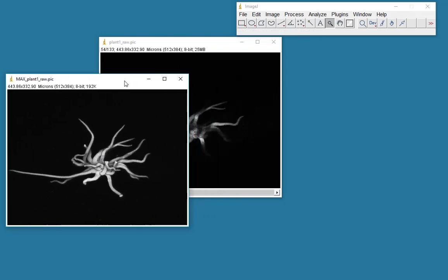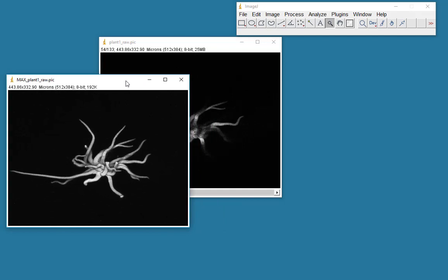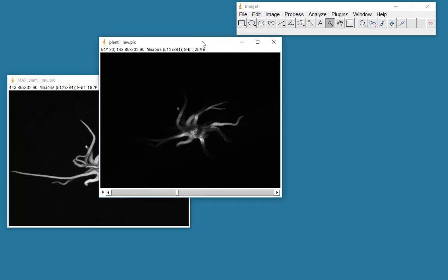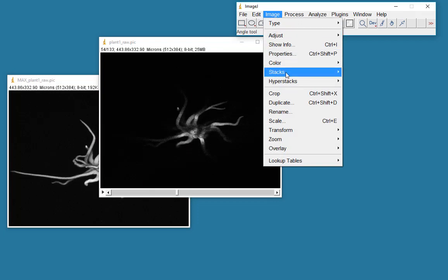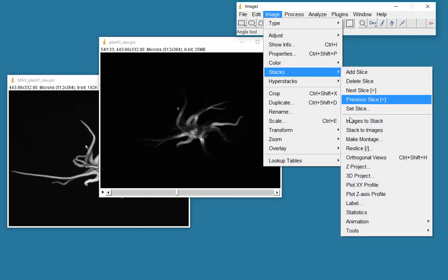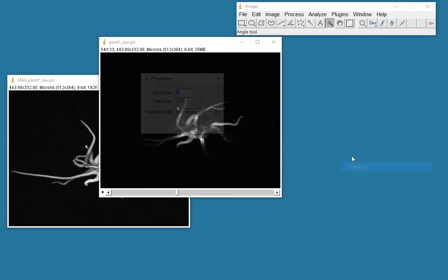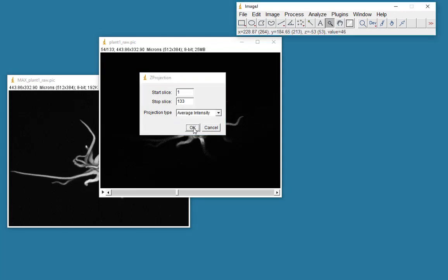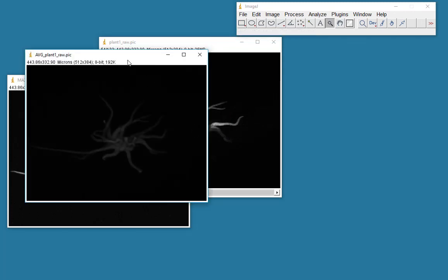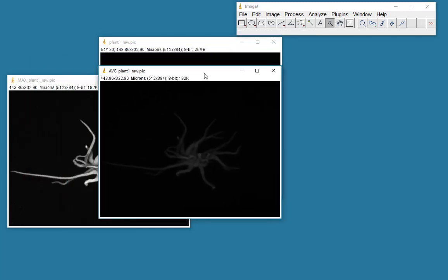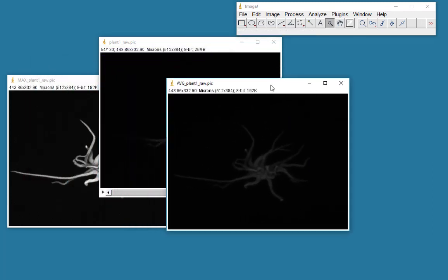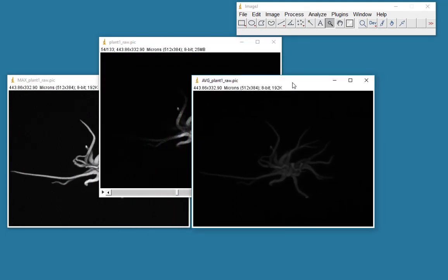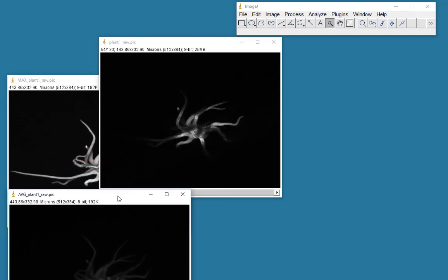What I could do is I could make an image which has the average intensity down a column of numbers. So let's select that. Go to Stack, Z project. And we'll do an average intensity. And obviously it's a bit dimmer because it's looked down the column of pixel values and taking the average. I don't tend to use that very often.